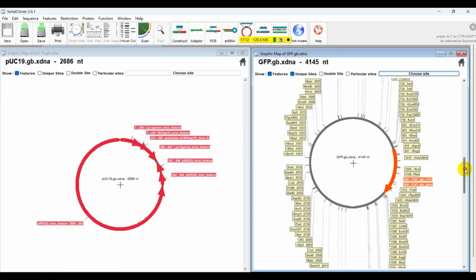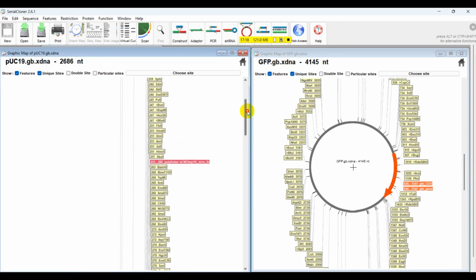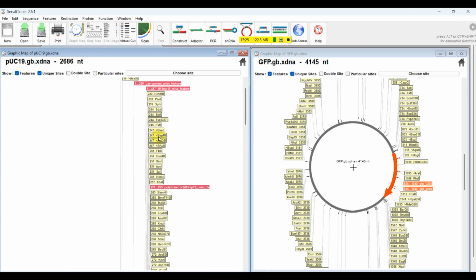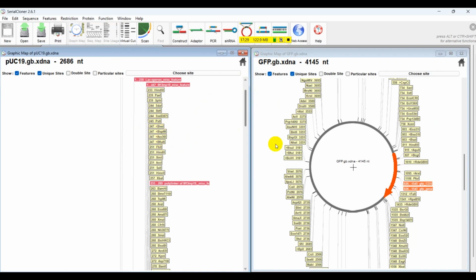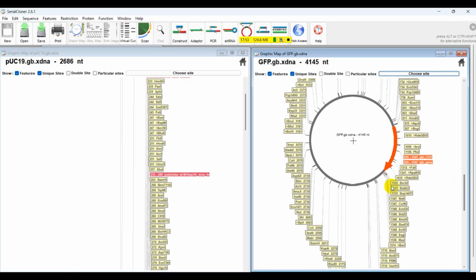So এখানে আমরা দেখতে পাচ্ছি এখানে একটা কাটিং সাইট আছে, আচ্ছা তোমাদের এখানে একটু দেখাই। আমরা মূলত we will mainly deal with the multiple cloning site because we need to cut here. তাহলে এখন কি করতে হবে, এখন এখানে দেখো এই জিএফপি জিনটা এখানে যেটা শুরু হয়েছে, এখানের একটা সিকোয়েন্স হচ্ছে 811, যেটা মানে নিউক্লিওটাইড সিকোয়েন্সের 811 নম্বরে HindIII রয়েছে। সো we can select HindIII from here, okay, and we can also select from this side one restriction enzyme, and which would be XbaI, okay.